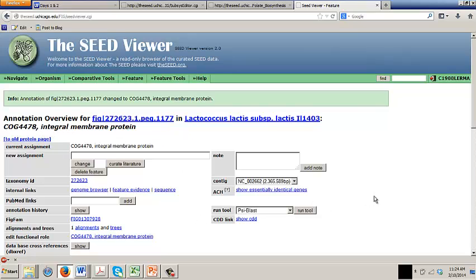Now, know this. From my terminal here, I've changed the annotation in a computer in Argonne, and I've changed it for everybody. So this protein has now been renamed in the central server that serves everybody. That means that if you had put it in your subsystem with the other name, vague though it was, it would now disappear from it because it doesn't have the same name, because subsystems work with names. So that's why renaming is a very delicate operation.